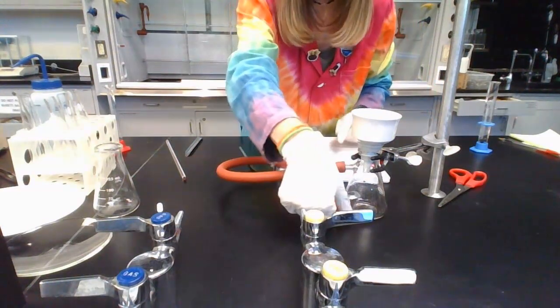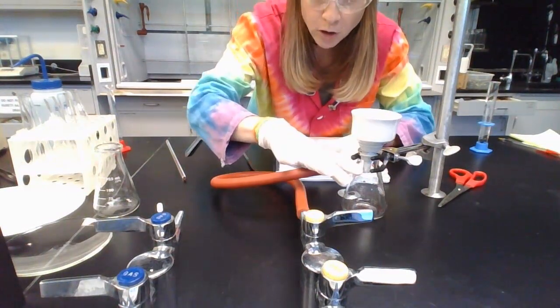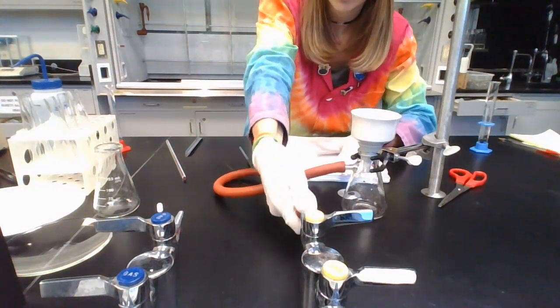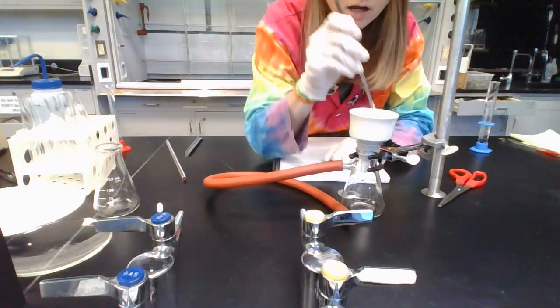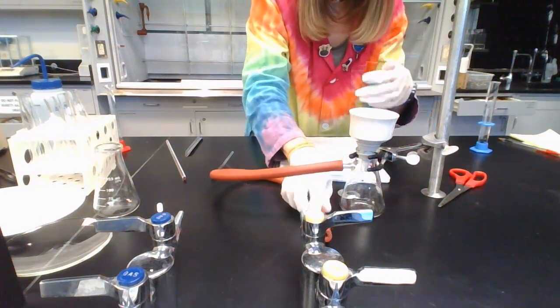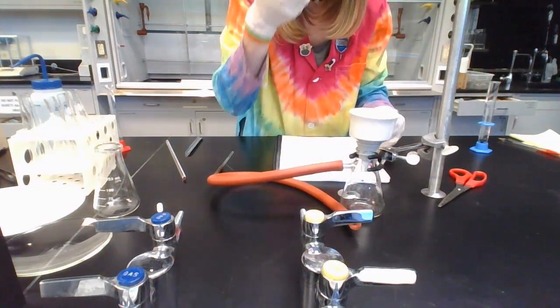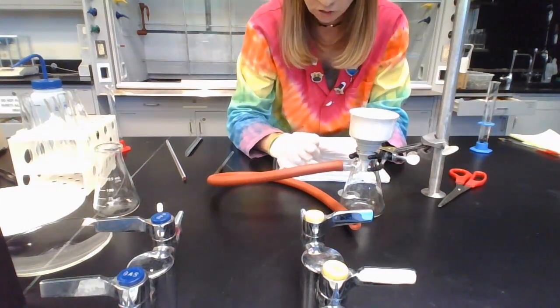And then it says to reconnect everything. Turn on the vacuum again, let the ice cold water go down, and then we're going to do it one more time. We'll shut off the vacuum by taking off the hose, turning off the valve, adding a little bit more water, mixing, put it back on, and then filter it. Okay. So at that point, you're going to leave the vacuum filter on for 5 minutes.